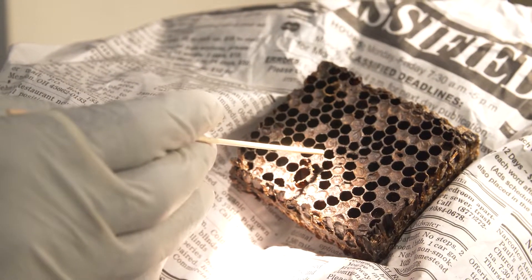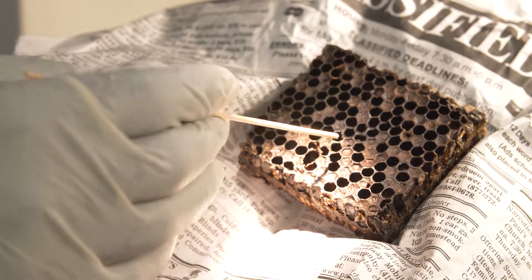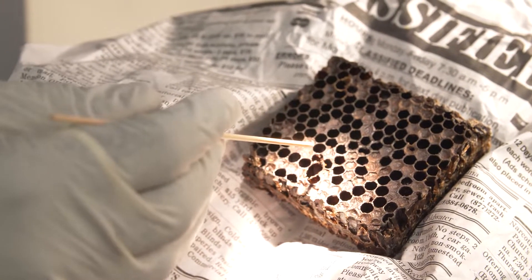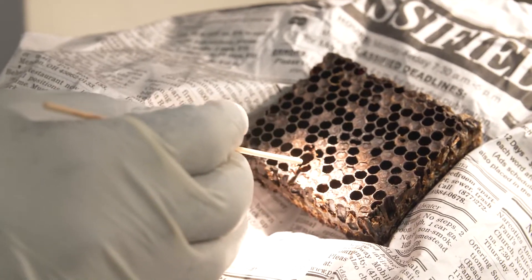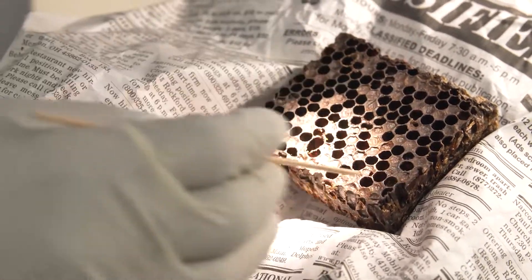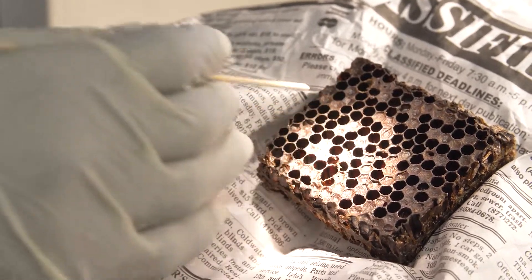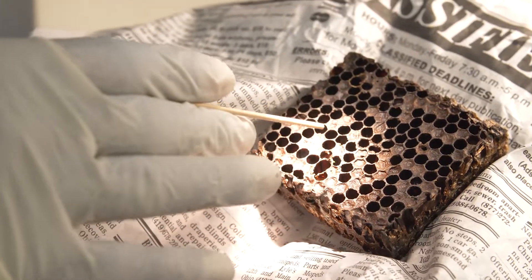We can also see that the bees have gone back and poked holes into cells to check what's going on, because they sense the brood is not developing. So for us, we start with those signs and symptoms of brood disease visible just by the sheer appearance of the cells themselves.